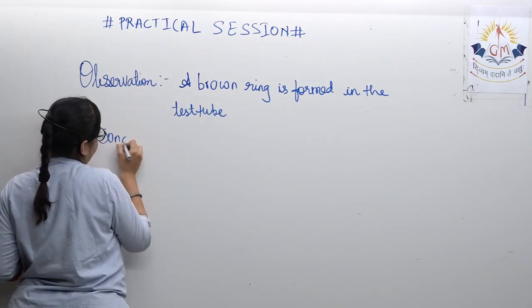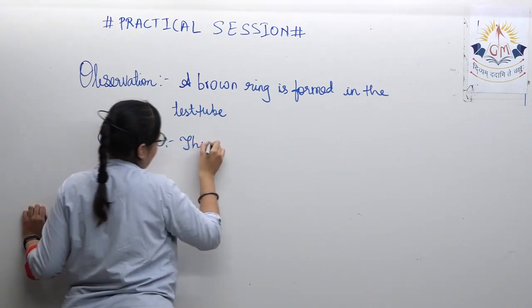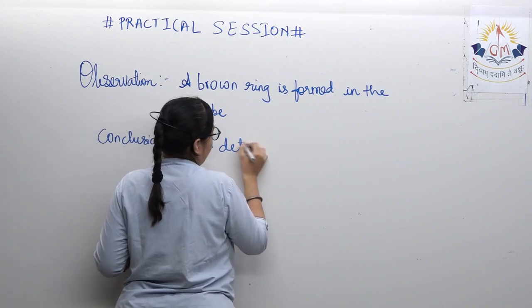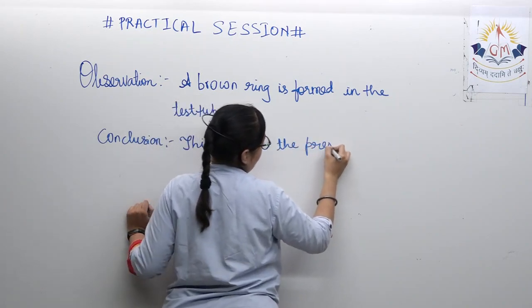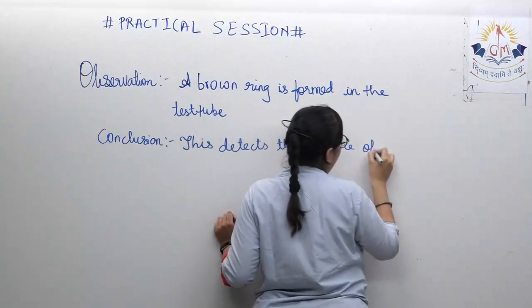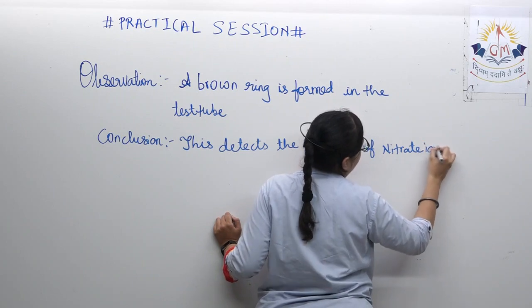Conclusion: this detects the presence of nitrate ion in it.